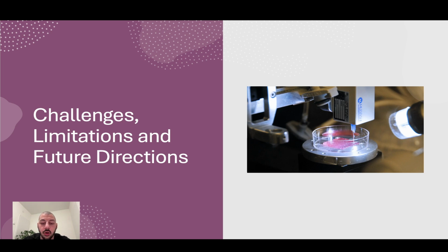Standardization issues are also a problem. Variations in bioreactor design and protocols can lead to inconsistent results. Now, to discuss the future directions, to overcome these challenges that I mentioned above, researchers are exploring several exciting advancements. For example, integrating the rotary wall vessels with 3D bioprinting. Combining the vessel bioreactors with bioprinting technologies could enhance scaffold based tissue engineering.